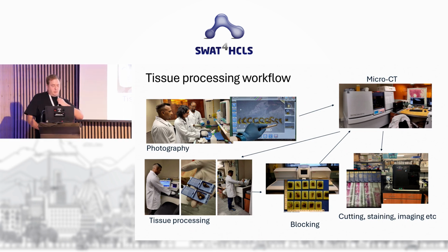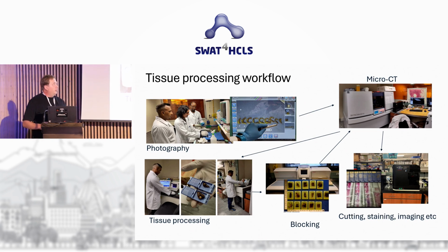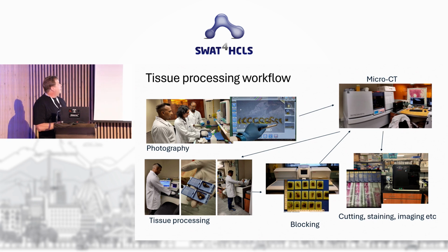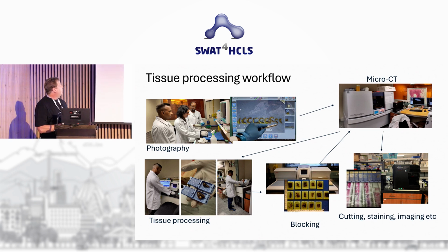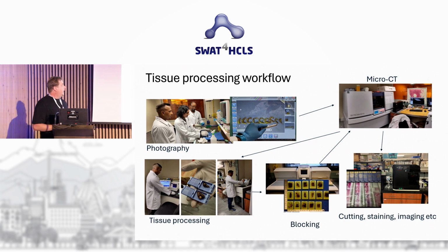So to get into where our data is coming from, this is what our tissue processing workflow looks like in a very brief summary. In the first step, we have this macropath table where we photograph the samples and label them. So that is Finessen Naidu, our forensic pathologist, and that is Kapongo Lumumba. He's a jack of all trades and helps us with the data curation, as well as autopsies and a lot of other things. This is Curation Naidu, and he is our histologist and histolab manager.